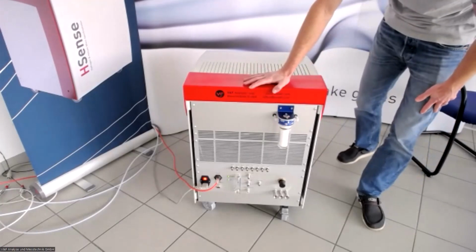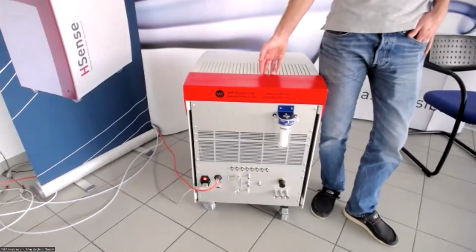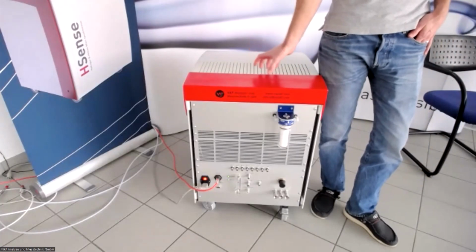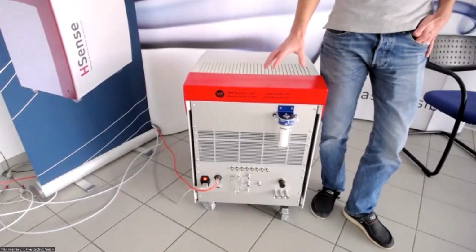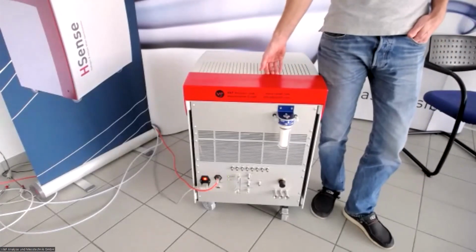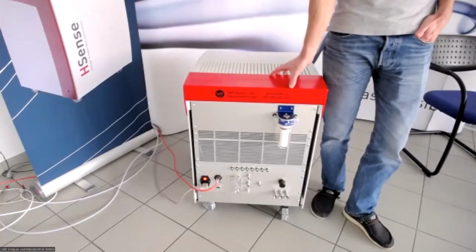This is one of the most important points with mass spectrometers. It is not something that you switch on for half an hour and then switch back off again. There's a vacuum system inside which takes a certain amount of time to be pumped down, meaning that when we operate these instruments, we usually switch them on and then they keep running until you really know, all right, I'm not going to need it for 1 week. But if you need it every day, the instrument keeps on running and the vacuum keeps on pumping.